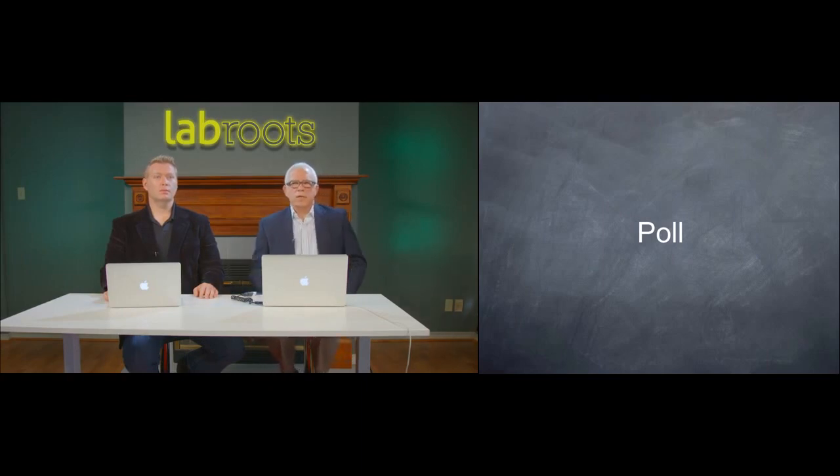After this meeting with this investigator, I became very frustrated because we do have a rodent survival surgery training program at our institution. This investigator and the entire staff in his lab have gone through the same training that everybody else goes through. And I said, what's wrong? How come we're not applying these things? We went through aseptic rodent surgery. What did we do wrong? So I said, things are going to have to change.